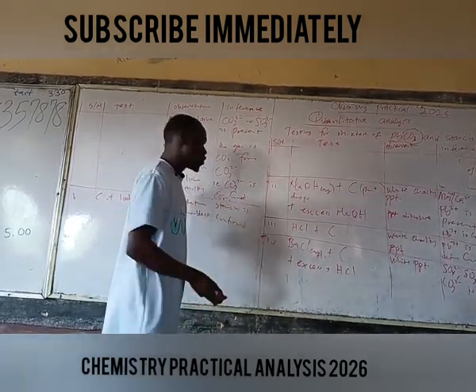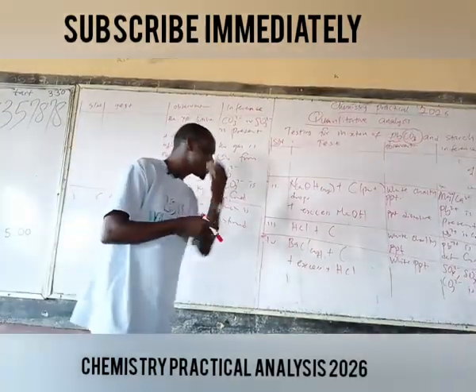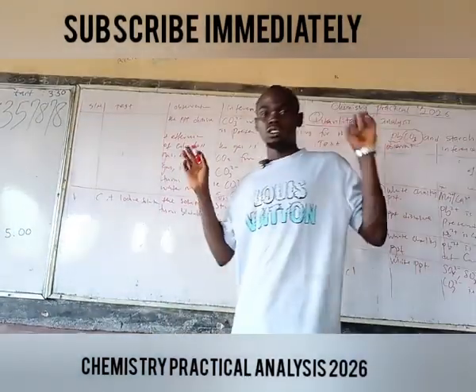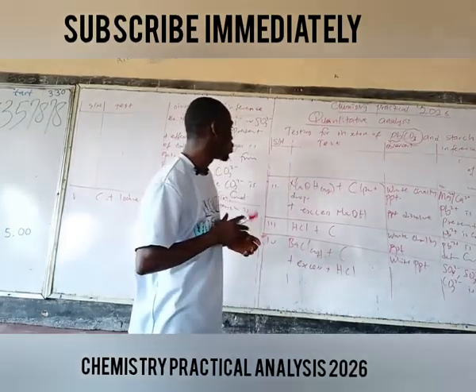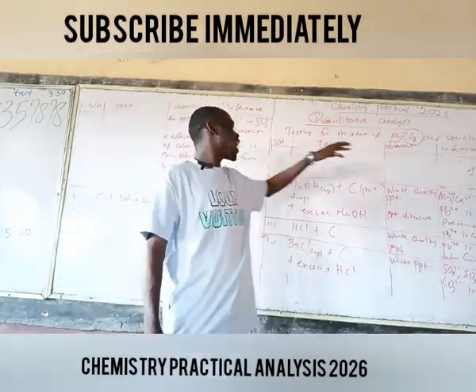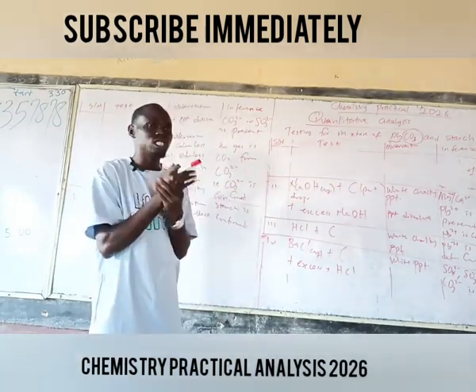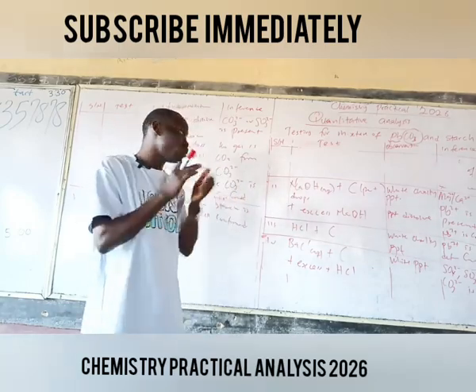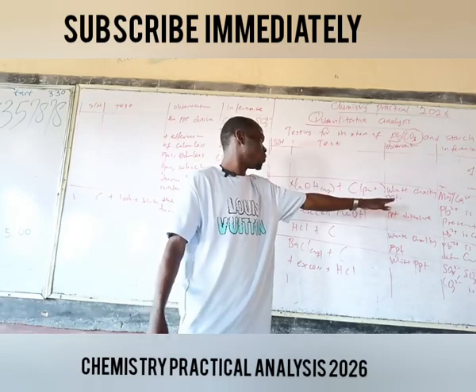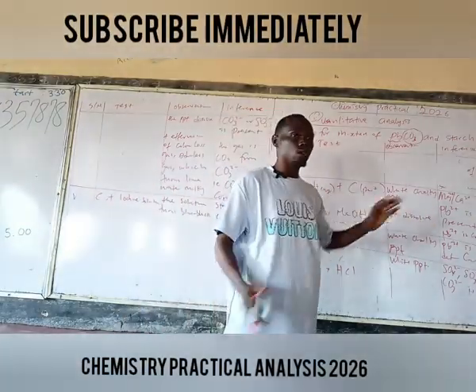Starch is confirmed. You can see now, if anything strange is asked, you are not to memorize this or write this into the hall. That is very bad. What is expected from you is that you want to test for lead carbonate and starch. How do we test for this? You dissolve. After dissolving, the basic reagent used for lead is sodium hydroxide. In drops and in excess. In drops, you have magnesium 2 plus, calcium 2 plus, or lead. Then if it is dissolved in excess, it means a complex ion is formed. That is lead 2 plus.